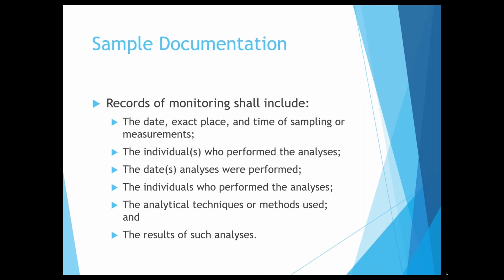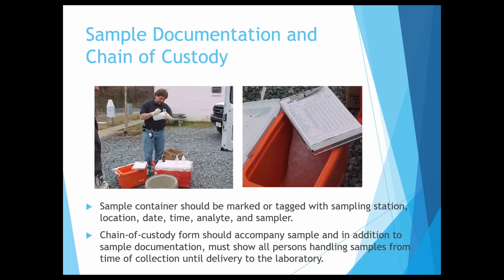So again, from Missouri, show me how you do this. I was at a facility and a guy was calibrating his pH meter. And he told me how he did it and it sounded perfect. And I was excited, so I just said, show me. And when he showed me, there was one button he kept forgetting to push after he did each calibration. So instead of doing one 3-point calibration with the 4, 7, and 10, he did 3 1-point calibrations because he forgot to push the equivalent of next, and he hit save instead. So there is a big difference between a 3-point calibration and 3 1-point calibrations, which eventually equals a 1-point calibration at the last item that you calibrated. So show me.